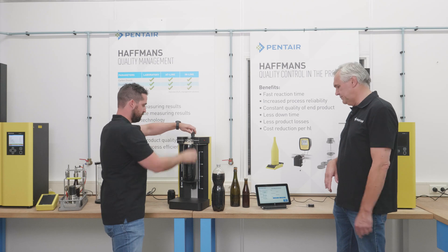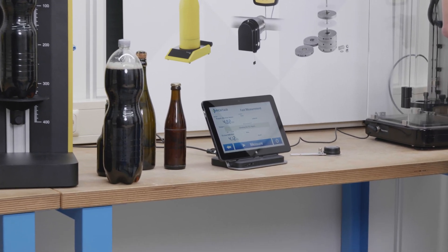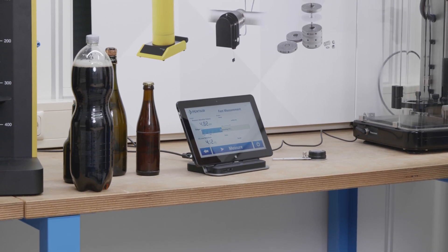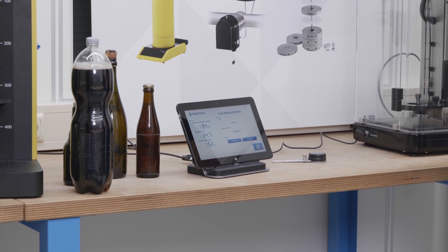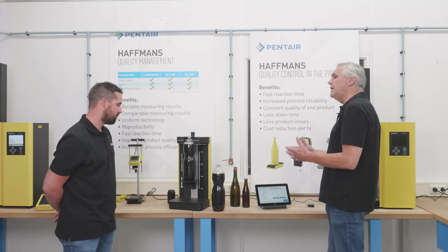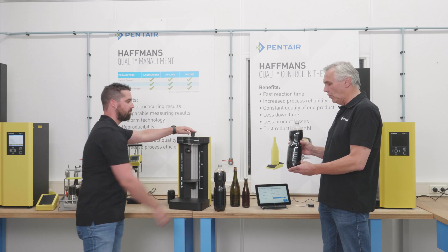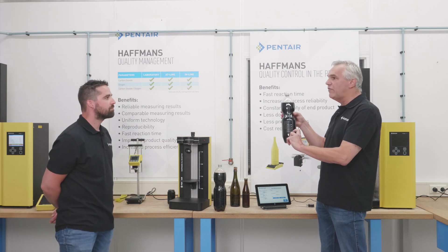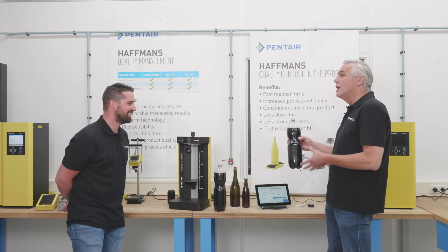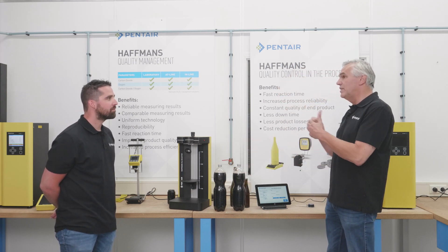Let's see what the soft bottle brings. It's installed and I will start the next measurement. This is much lower — it's only 1.5. So we see that 2.5 volumes are lost. You can see the difference. Looking back to the bottles, the soft bottle shows the same effect you see when there is only a little bit of beverage left. Would you drink this? No, nobody drinks it. The bottle is wasted. And that's exactly what this instrument checks — that the quality supplied is within specification.